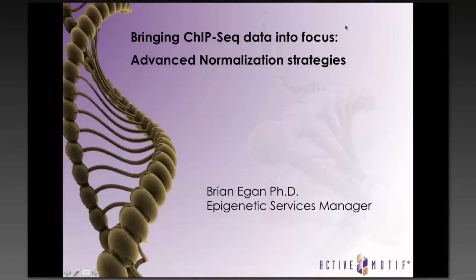Before I present that work, I want to get everyone up to speed by giving a brief introduction to epigenetics and ChIP-Seq, and then I'll talk a little bit about our ChIP-Seq service, and the majority of the slides will cover the spike-in strategy that we developed to normalize ChIP-Seq data.